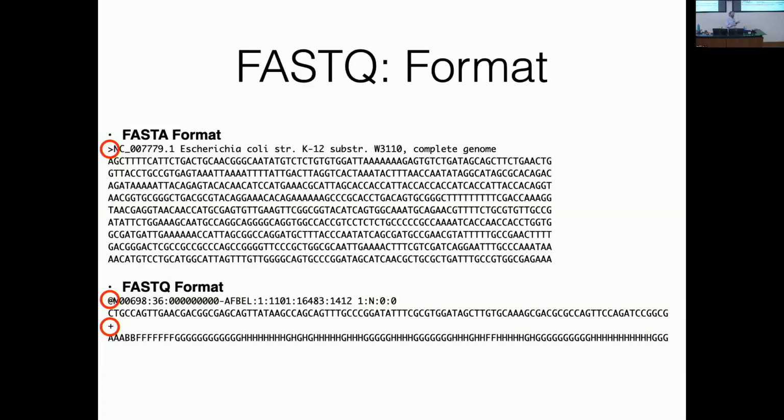Another place that I'll tell you, just in case you decide you want to write your own FASTQ parser, is thinking that you can search through the file for @ and that'll tell you all the header lines. @ is actually a valid quality character, and so you will see @ signs in the quality scores, and those are obviously not beginning a header line. That's a rookie mistake.